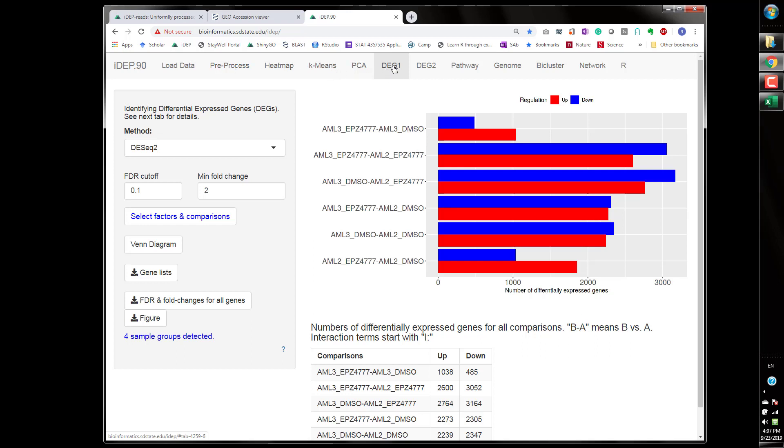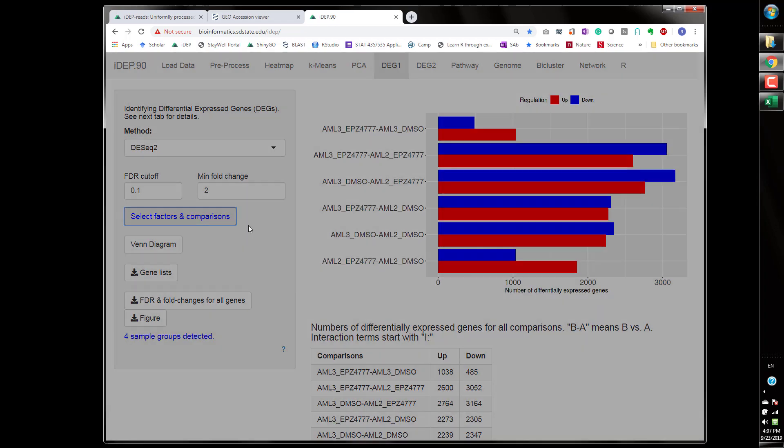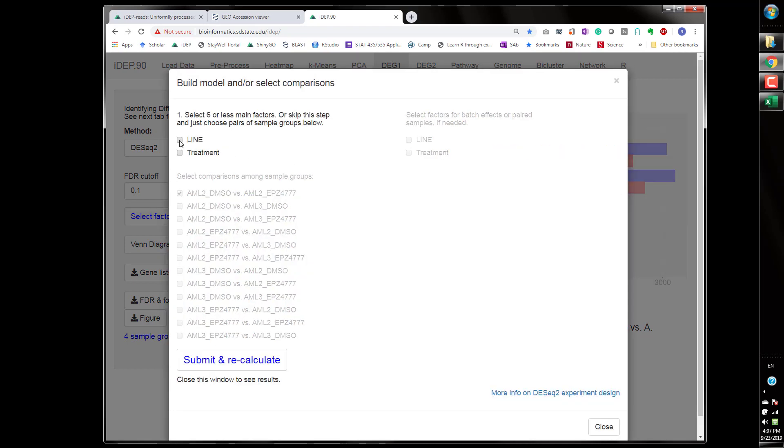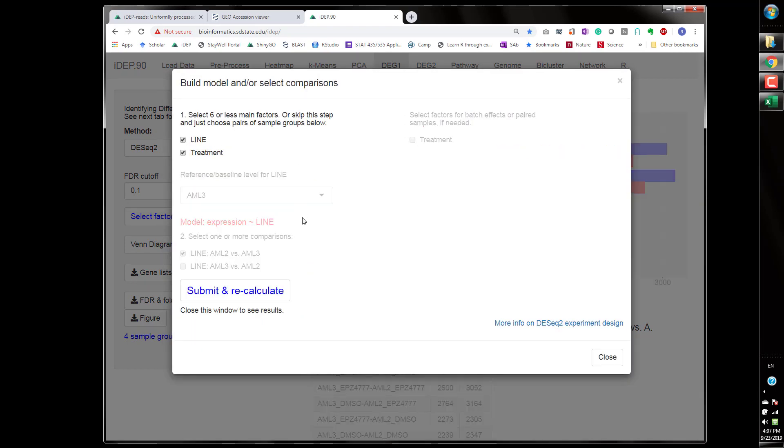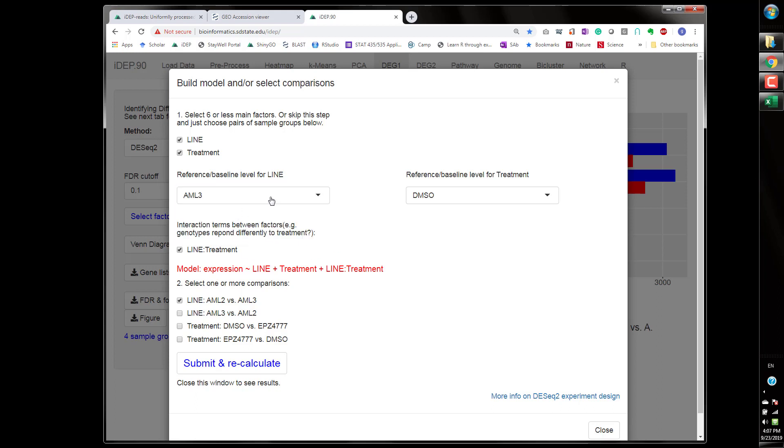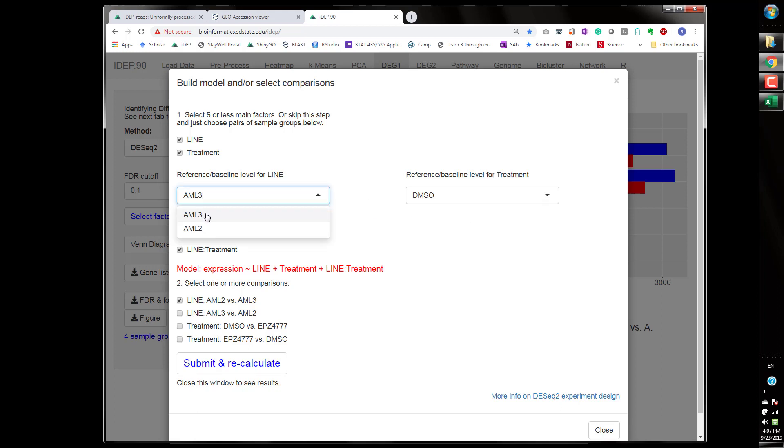But in here by default it runs pairwise comparisons of all four groups. Since we have two factors we can use these two factors to construct a model and also use the interaction term between the cell line and the treatment. Make sure this is the desired reference level that makes more sense. This is control this is treatment. If one of them has a mutation that you want to use a wild type as a control as a reference level.